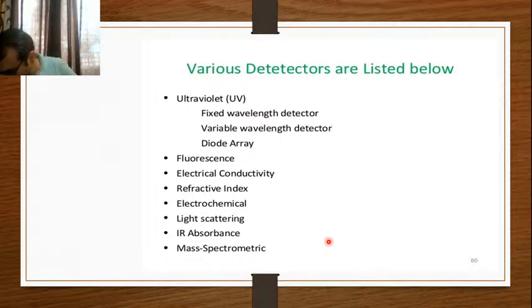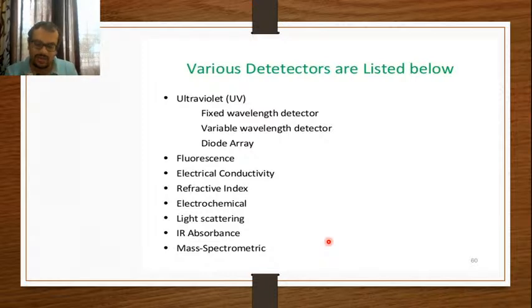Dipesh, good. Pratiksha, yes. What I mean to say, gradient elution and isocratic elution are two terms which we already dealt with. Isocratic elution is what? Throughout the separation process of HPLC, the composition of the mobile phase remains the same. It does not get changed. But some mixture analyses will require that the mobile phase composition needs to be varied, in terms of mobile phase strength.